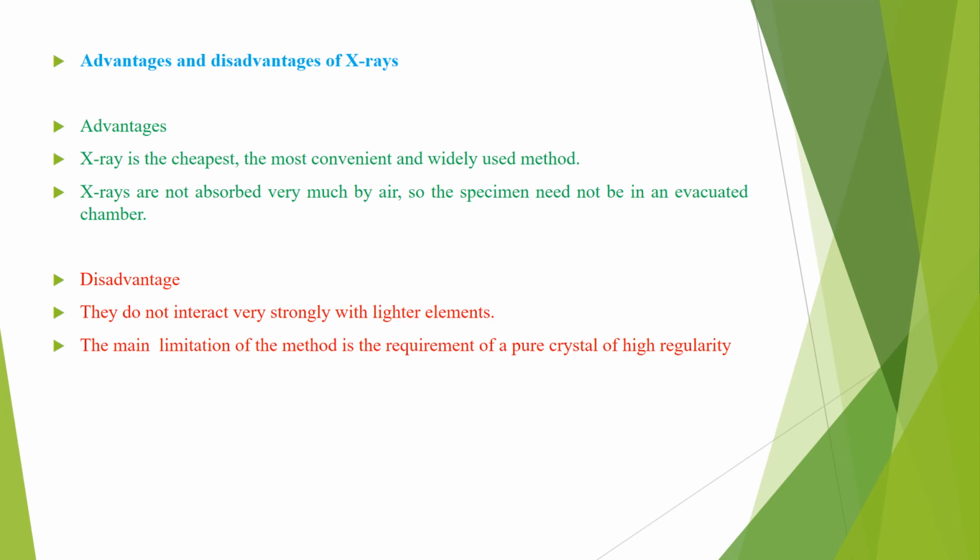So the first advantage of using X-rays is that X-ray is the cheapest, the most convenient and widely used method. That's why this X-ray is used in single crystal X-ray diffraction technique.